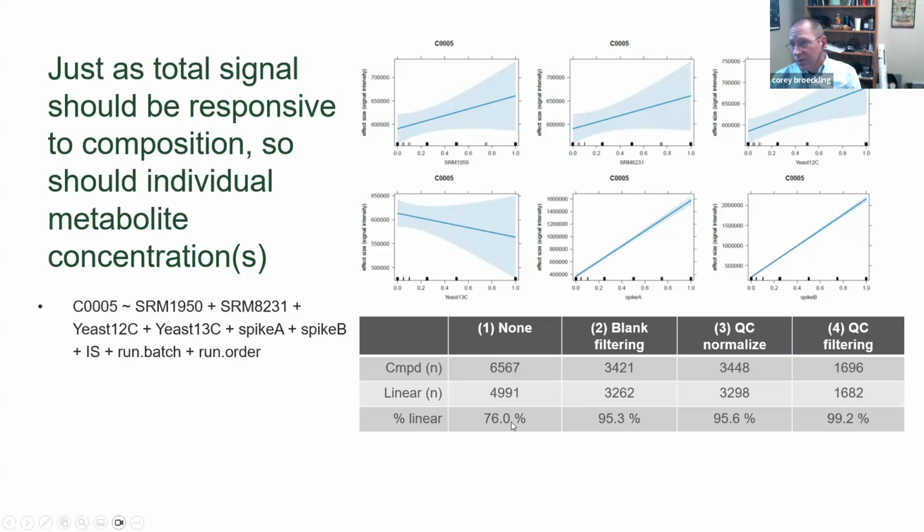I then took it through some processing steps. If we did blank filtering, to say it has to be present in one of the samples at least 3 times higher in the QC samples than in the blank samples, and we eliminate all those that are not, we've eliminated approximately 3,000 compounds using that filter. And maybe that's too much, but that's the result of it.